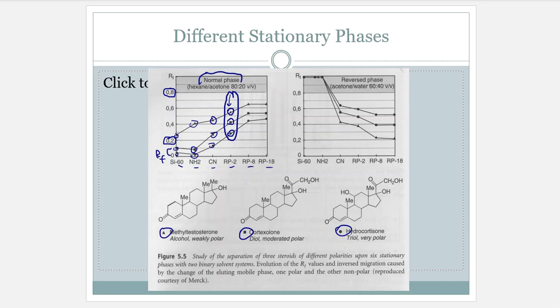Separation's still there. They are not overlapping on top of each other. That's fine. Separation took place. But I'm now in the working threshold of where I need to be. All right, well, if I go to RP8, well, this is okay as far as 0.8 and 0.2s go. They work. The spots are closer together, but they still work.